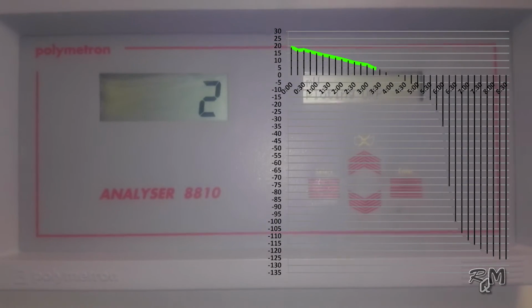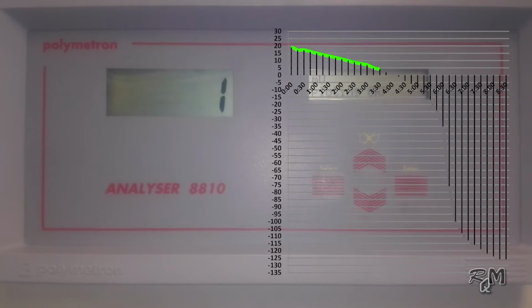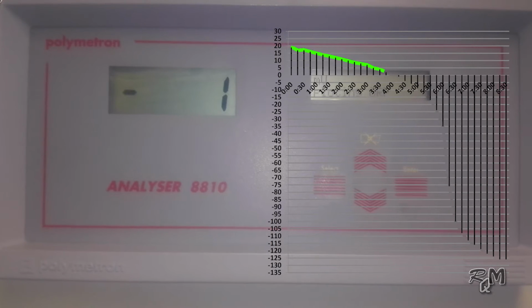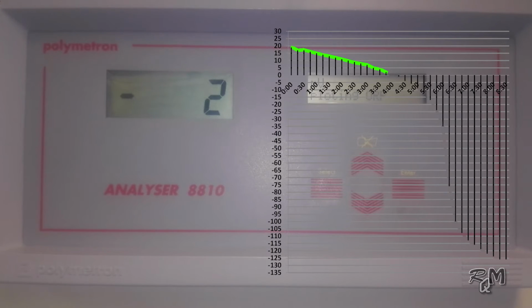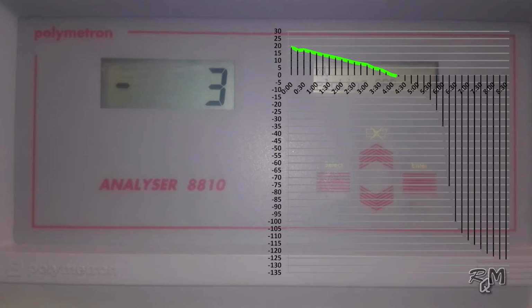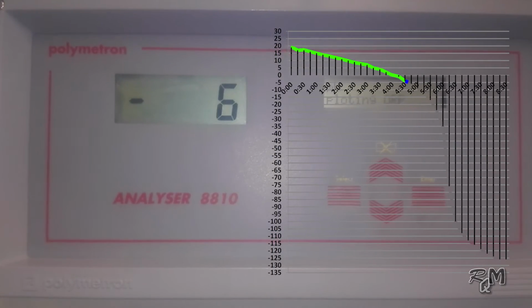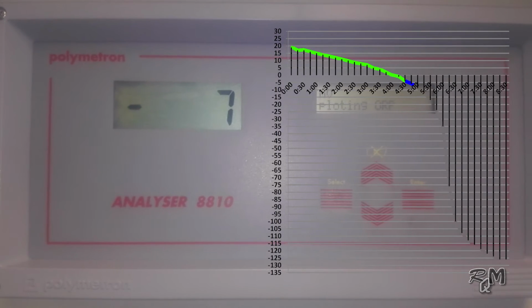As I told you, it is a too slow and boring process. In real time, it is slower than what you are watching now. I have already increased the speed of the video to 170% to keep your interest in this process. Now you can see after 0 millivolt, the rate of change of millivolt starts to increase, but still you can count it easily. Usually after this, I start to count millivolt values silently to catch that point of millivolt value after which the rate of change of millivolt becomes so high that I cannot count.